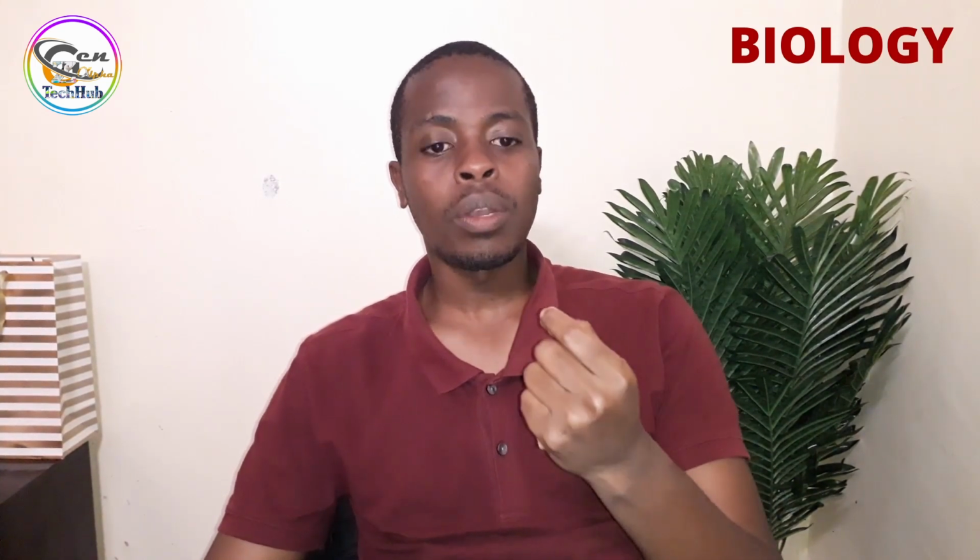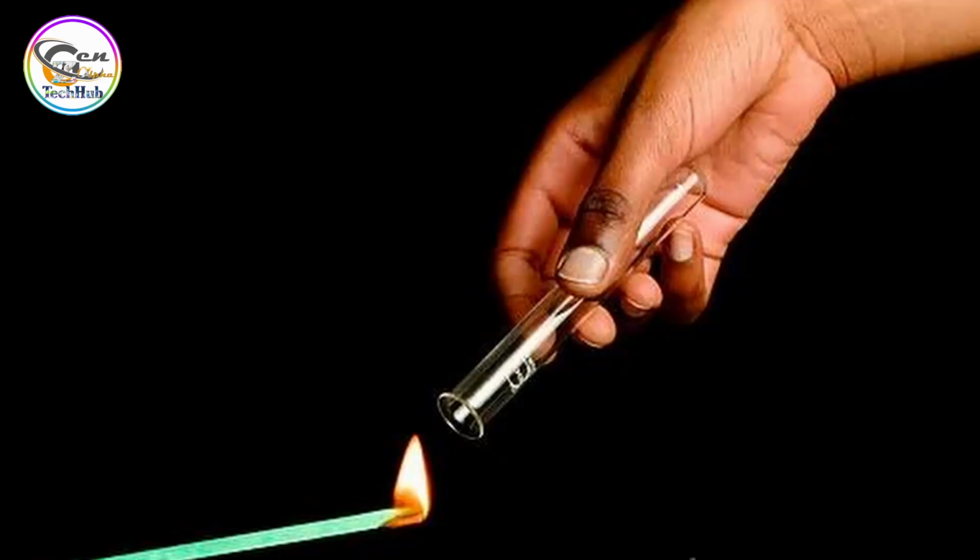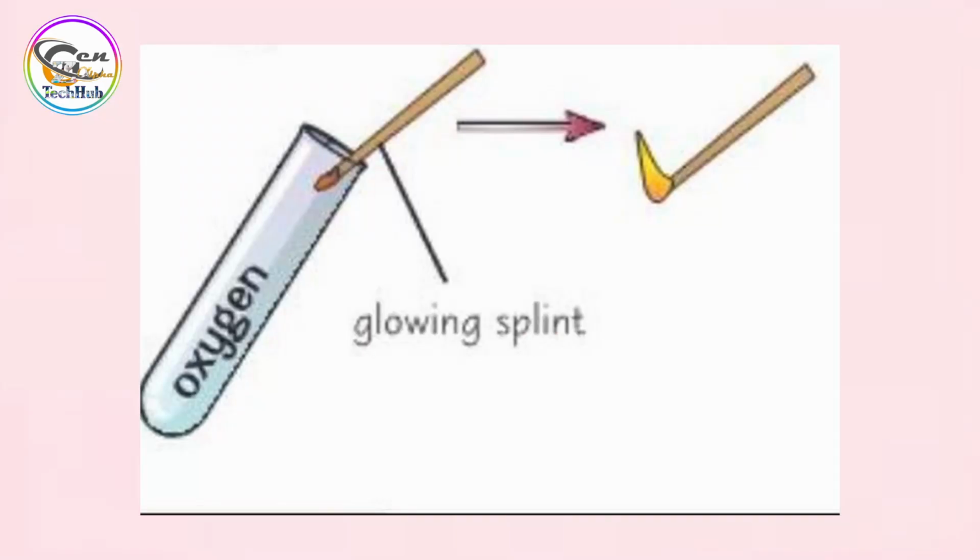We are going to carry out a chemical test to ascertain that the gas collected here is oxygen gas. And to test for oxygen gas, we use a glowing splint. Take a wooden splint and put it on a flame. It will catch the flame, but extinguish the flame, and the splint should remain red hot. Insert it in the test tube that has the oxygen gas. If the glowing splint relights, that demonstrates that indeed the gas is oxygen gas. That is a simple experiment that is used to show that the gas collected in the process of photosynthesis is oxygen gas.